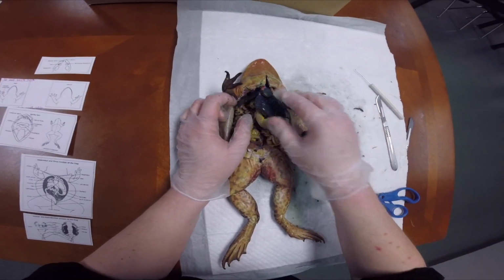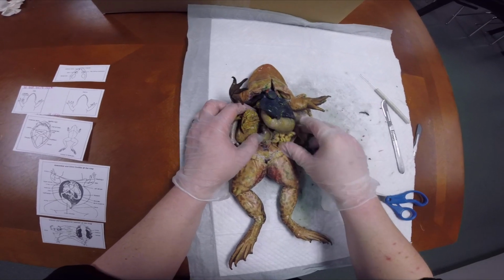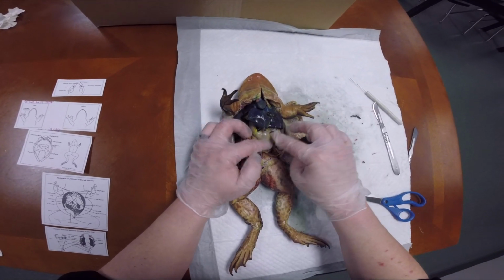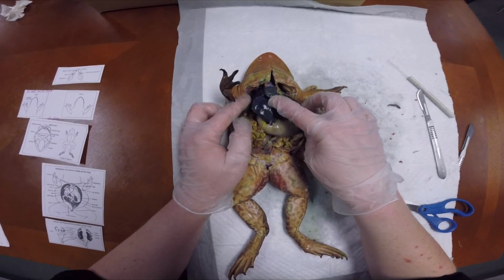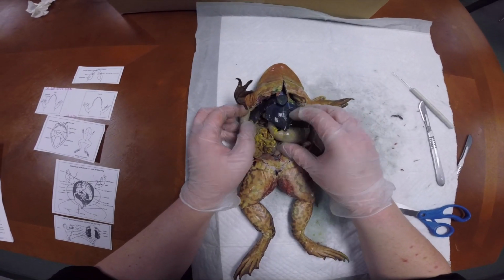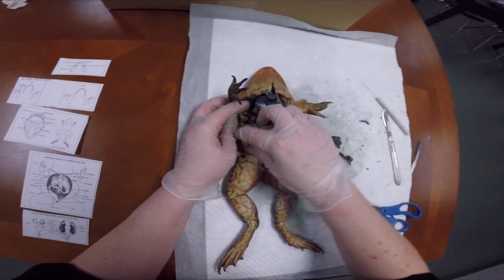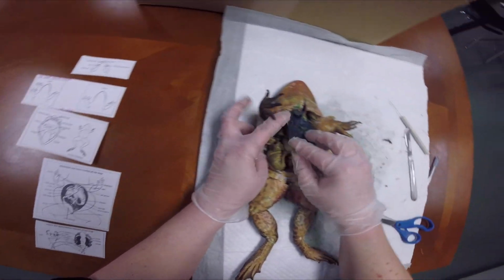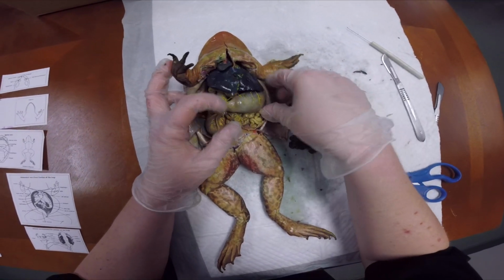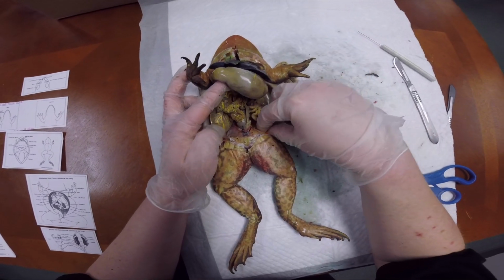Once we get all those eggs out, now you can kind of see the inside portions better. And this one looks like it has something in its stomach, so it'll be fun to open that up and see what's in there. Okay, so now we're going to try to identify the parts on the inside. I'm just going to check and make sure I got all the eggs out because there's always a ton hiding. I think I got them all.